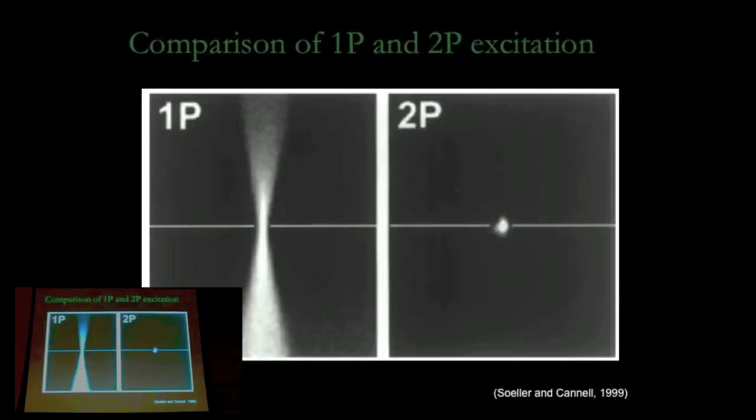Another type of microscope that I have in the facility is a 2-photon microscope. So this uses infrared illumination to excite the fluor. Infrared photons have less energy, and it takes the simultaneous absorption of 2 infrared photons to excite the fluor up to the excited state. And you only get that photon flux right at the focal plane of the objective.